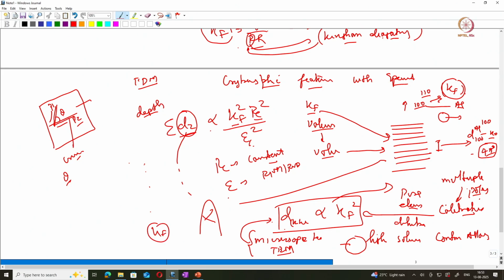Okay, so several microstructural features which are crystallographically oriented in an alloy, or the interfaces, and their size, we can use the orientation, we can use the size of those precipitates. If you know the size of the precipitates from TEM, then we can calibrate the reconstruction by changing the kf value based on the known size of the precipitates, or the thickness of a thin film.